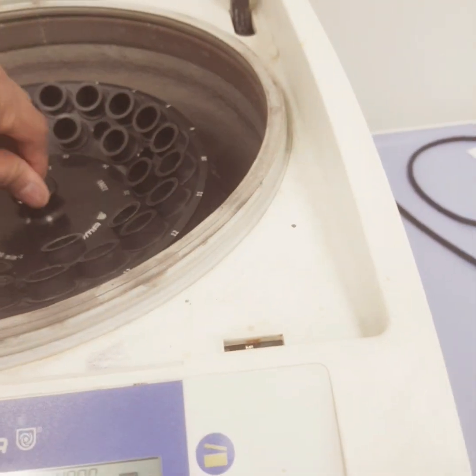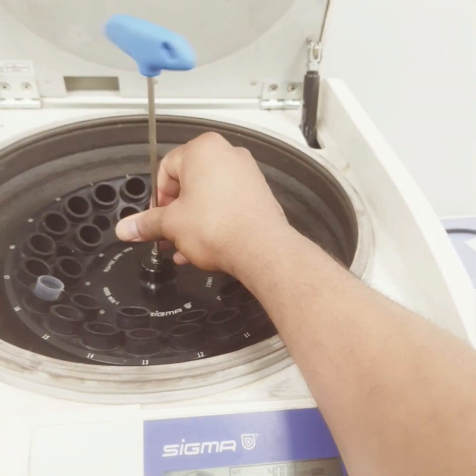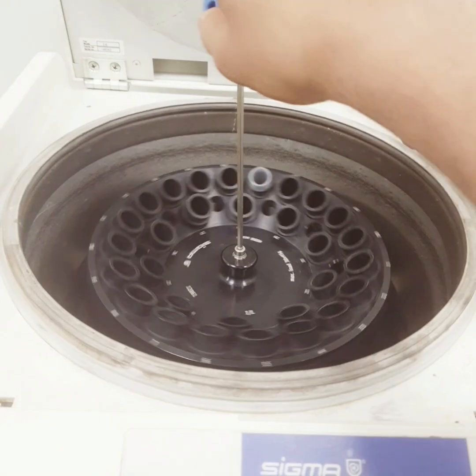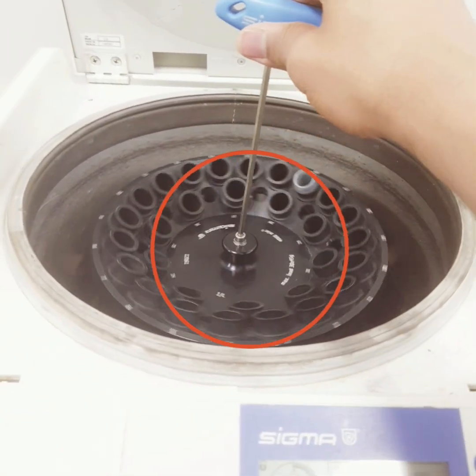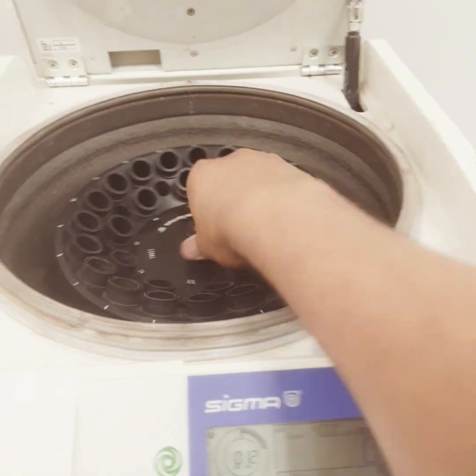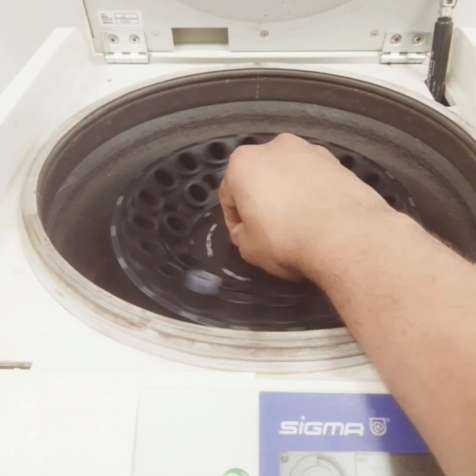And then just a normal hand-tight. This way you can change the rotor, or you can say change the vial holder of the centrifuge.